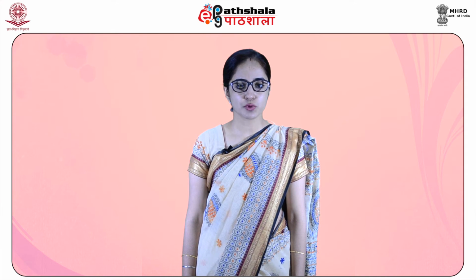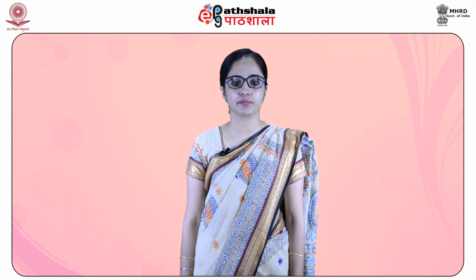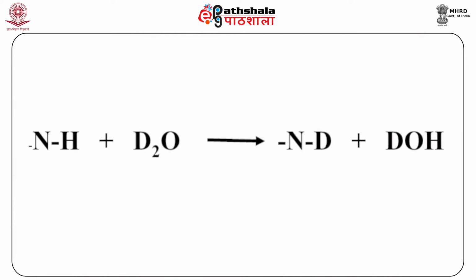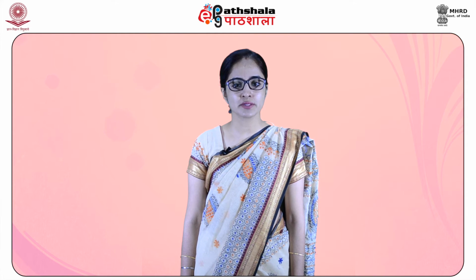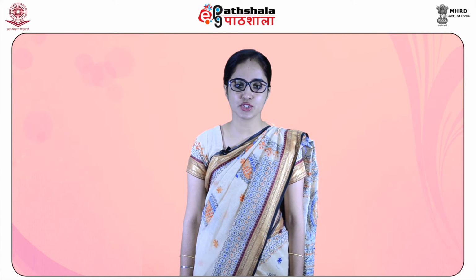Moreover, the NH protons often show broad and weak signals and rarely show coupling to the hydrogens on the adjacent carbon atom. This can be caused by chemical exchange of the NH proton or due to quadrupole broadening. The amino hydrogens will exchange with D2O, causing the peak to disappear, as you can see in the reaction shown here. The NH peaks are strong in aromatic amines, where delocalization of the lone pair of electrons on the nitrogen appears to strengthen the NH bond by changing the hybridization.